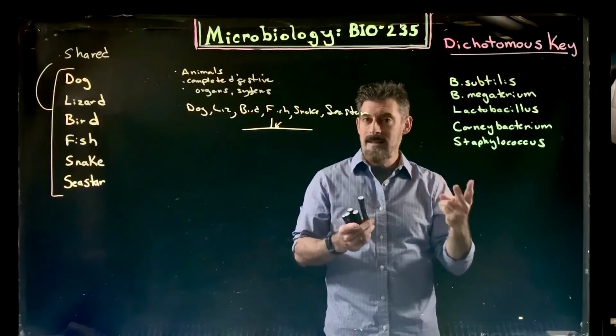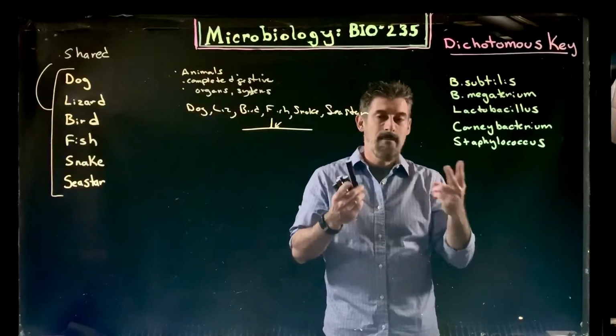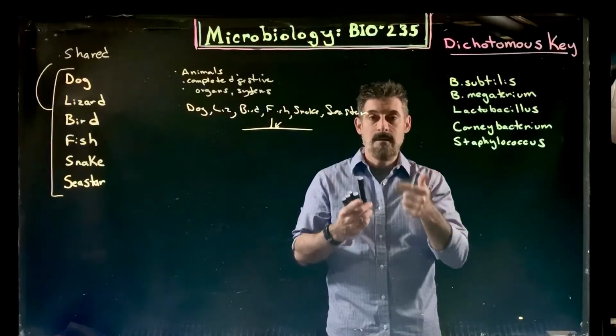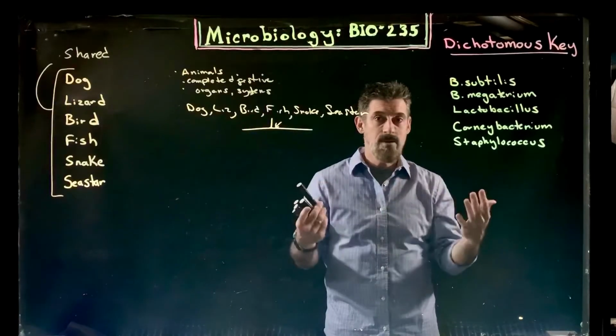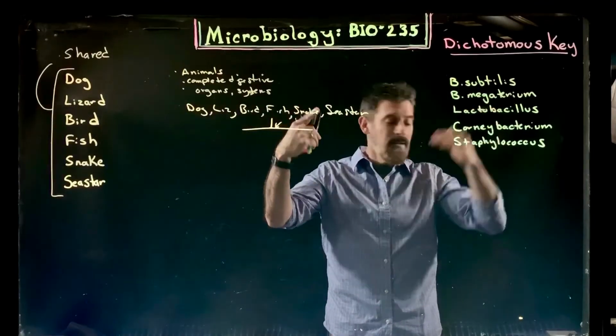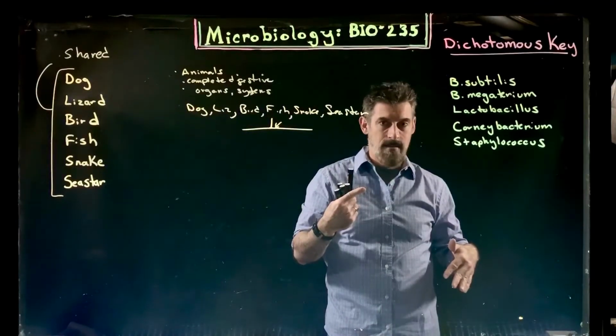After that, one of the second things that you would usually wonder about the bacteria are what's its shape or morphology. Is it a cocci, a bacilli, a spirilli, a vibrio? What's the shape of the bacteria? So that would be another characteristic, and a big one right at the very top. That's not something you would usually do later, okay?